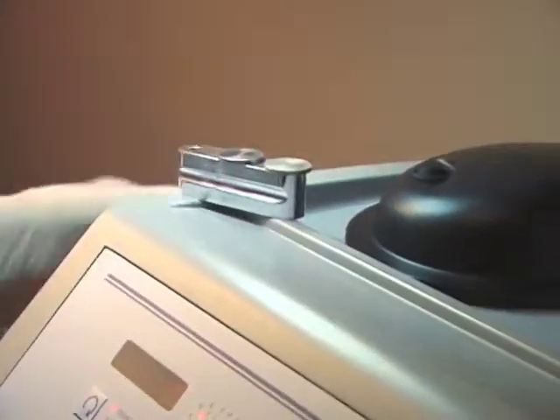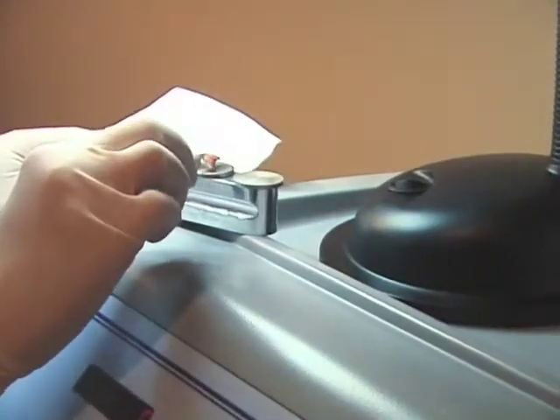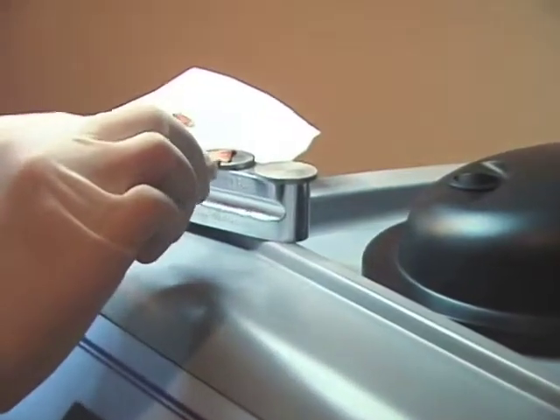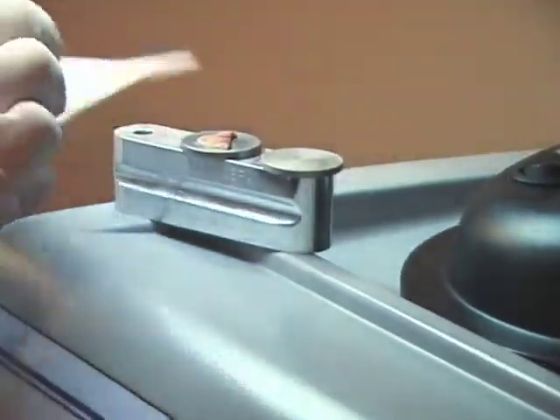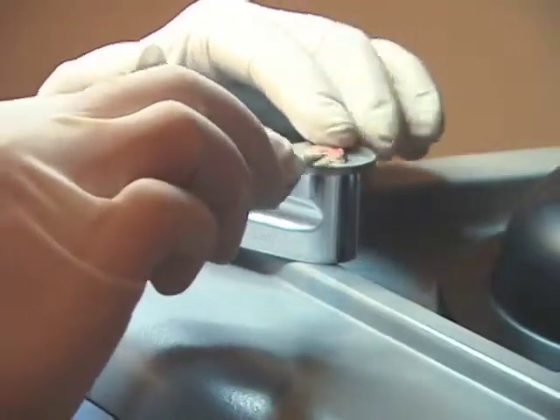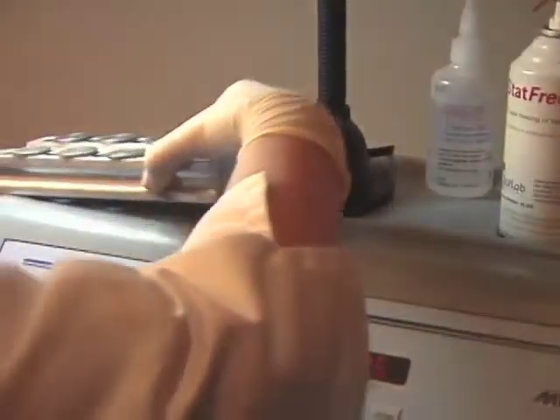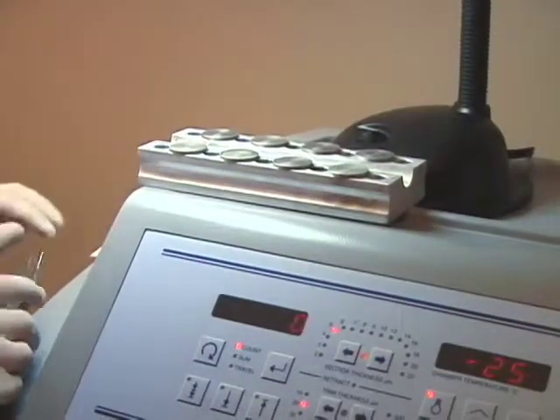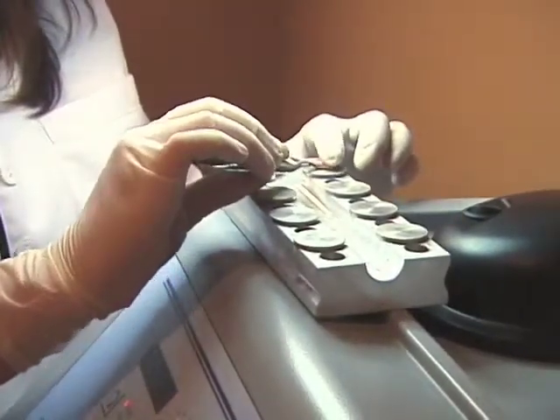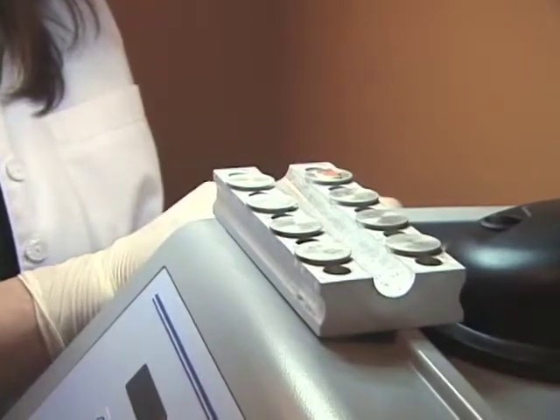Often specimens need to be bisected. With the cryo embedder, more than one specimen can be oriented and frozen simultaneously. Simply place two or even three flat discs on the embedding device and freeze the samples at the same time. Many offices do MOHS on very large sites. Specimens this size have to be cut into smaller pieces in order to fit on a microscope slide. Using the button holder that comes with the cryo embedder system, eight pieces can be oriented and frozen where they are ready for cutting in less than three minutes. The mass of this piece of equipment will retain its temperature for long periods of time outside the cryostat chamber; however, only moments are needed.